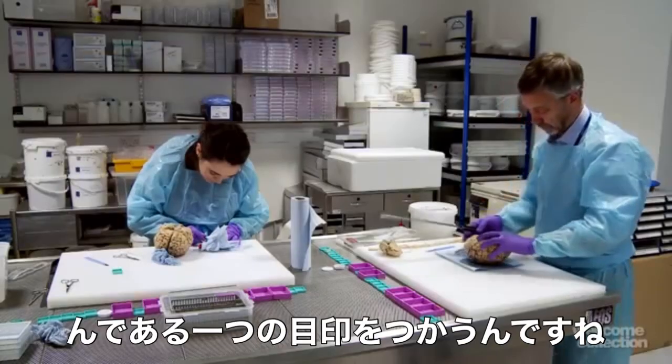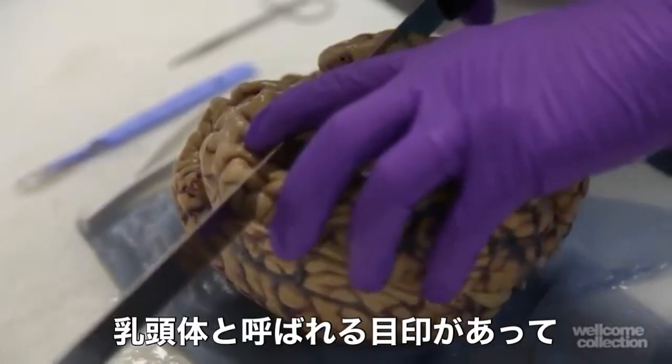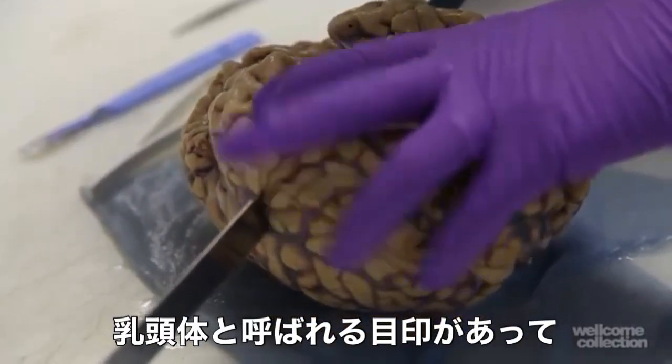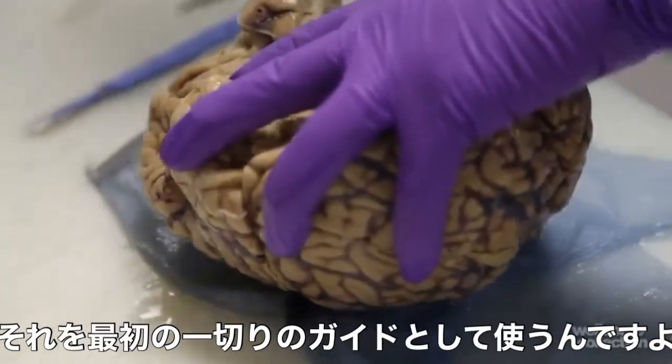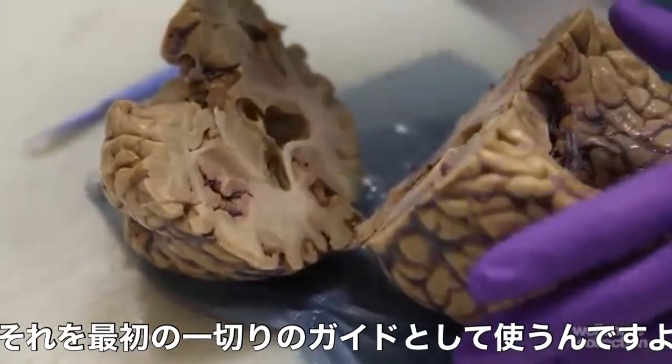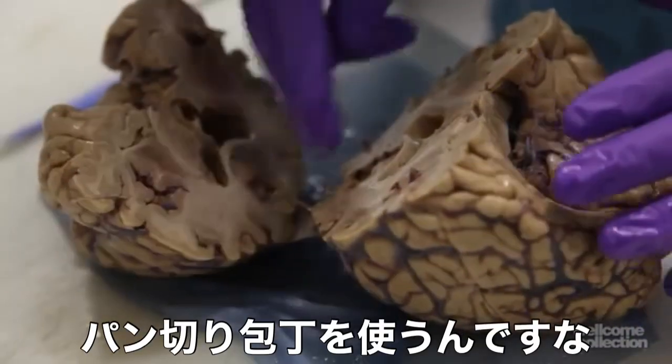We use a single point for our first cut. We have a landmark called the mammillary body — it's a part of the brain involved in housekeeping functions — and we use that as our guide for the first cut, using a rather large bread knife, if you like.